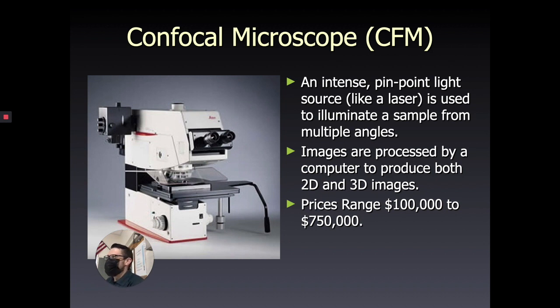So about 40 years ago, scientists said, well, what if we take this same concept of the compound light microscope, but try using a more intense light source? So what if we use a more focused light source like a laser?